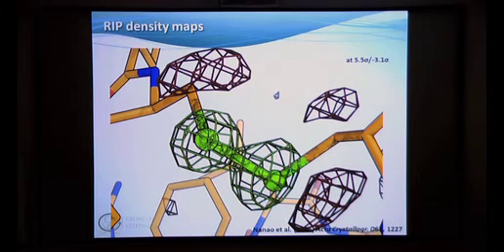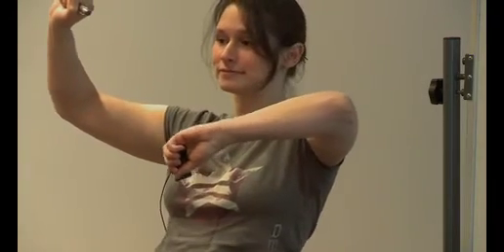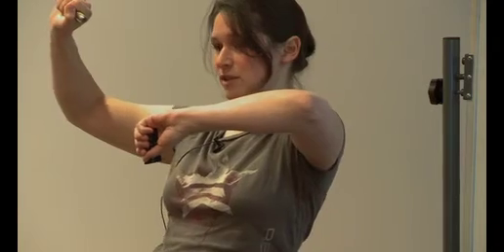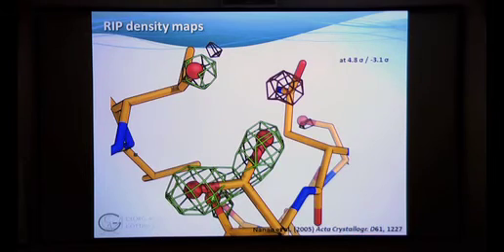So we see that the disulfide bridge has been there in the before data set, but after radiation damage, these blobs appeared and these vanished. What happened is the disulfides were bridged to each other, and then it was cleaved, and it just went open. So possibly some sulfurs vanished completely, but we can assess this kind of effect with calculating such density. This is another example from the same data set where CO2 was lost.